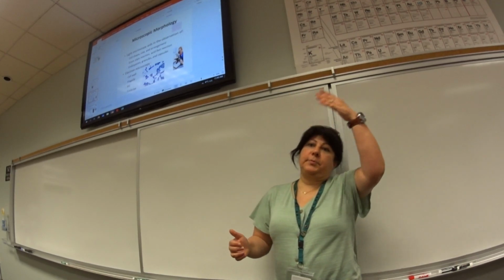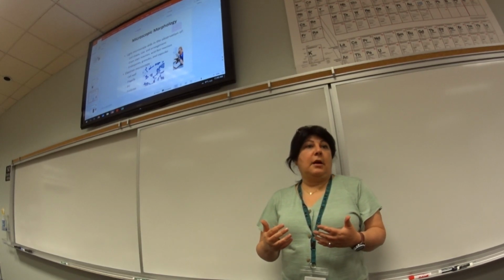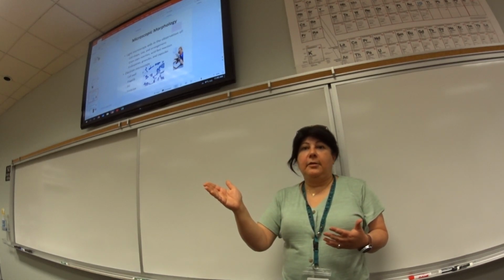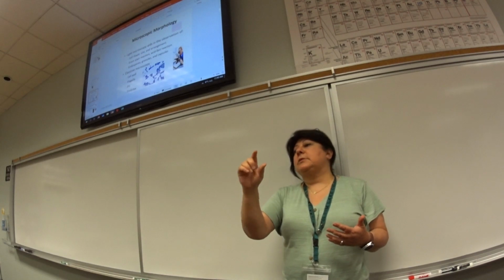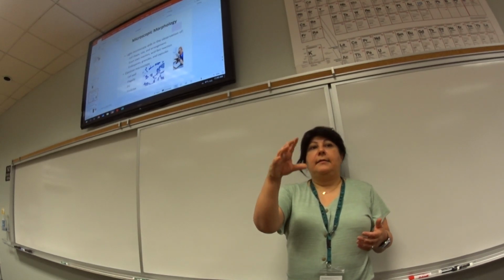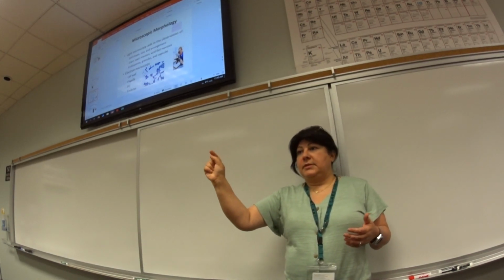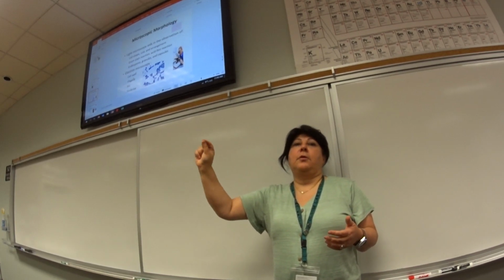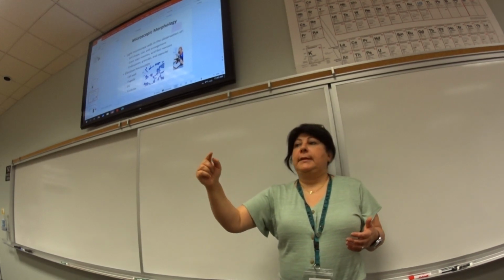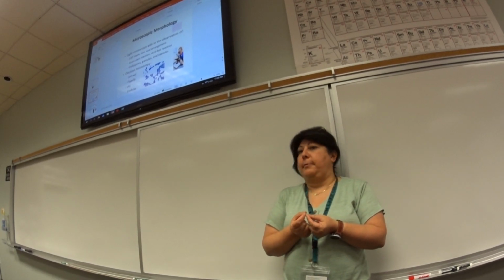Day 3, which will be your next Monday. Again, you come, you get your results, you just start with results. You don't have any methods and material at that point, you start with your results. Let's say it's indole. So for results at the top, say indole results was read after Kovacs was added. Gelatinase was read after it was put in the refrigerator. So make sure that you put that, then create another table for me.